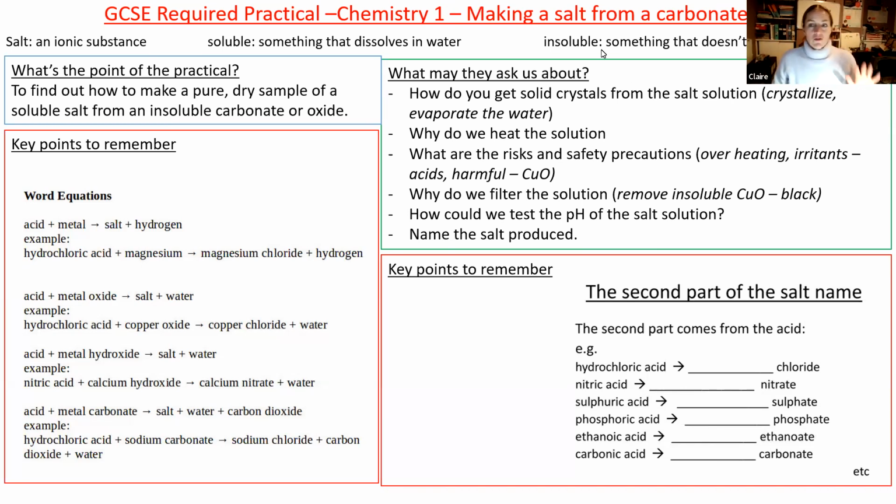Okay, right. Anyway, so there, 4 practicals. Can't remember now. I think there's 4, but 1 for separate sciences as well. So the first one, which I think even year 9s have done now, possibly, is you're making a salt. It's going to be from a carbonate or an oxide. Now, I have summarized this on 2 sides because it's a bit too much. So there's key things on here. So a salt is an ionic substance. So we have already covered ionic bonding, things like that in the 2nd module. Some year 10s would know that, year 9s you're getting onto that.